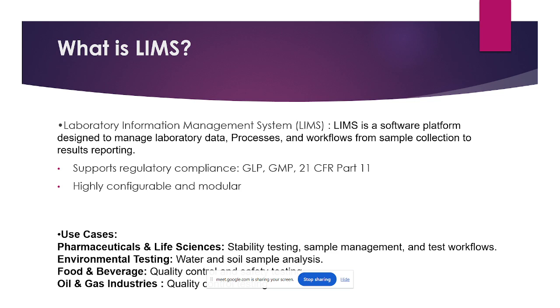Three major rules were updated, like audit trails, and more compliance is required. Also, a LIMS application is highly configurable and modular. Based upon the business requirements and our workflows, we can configure the LIMS application.